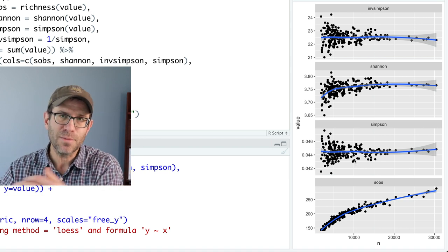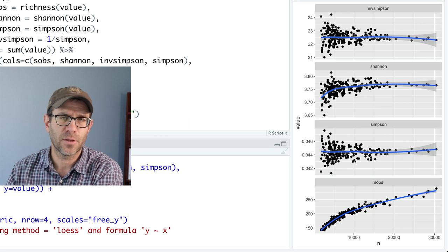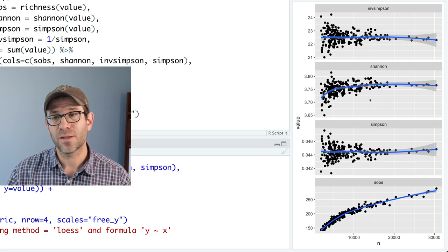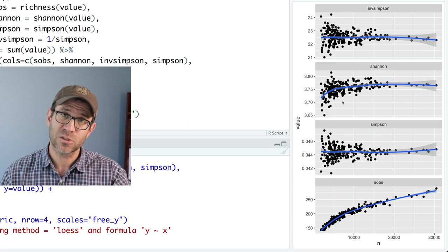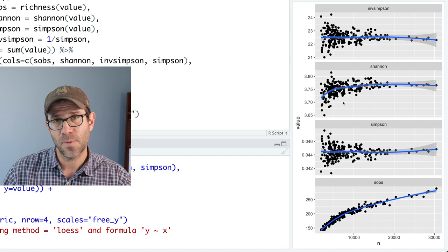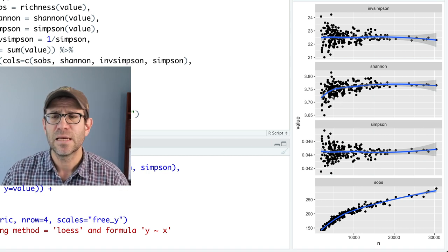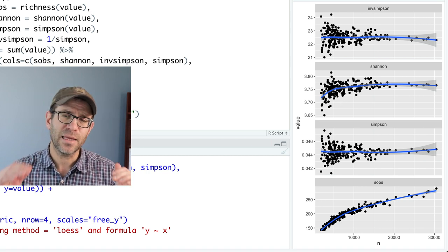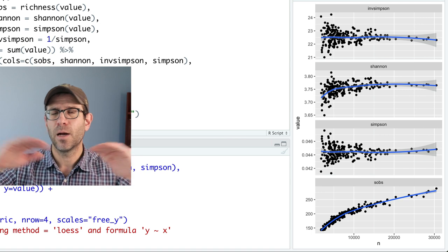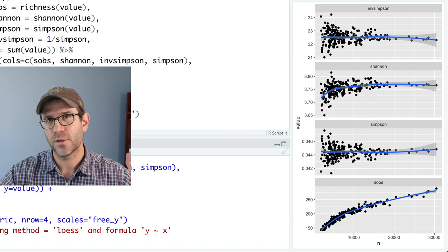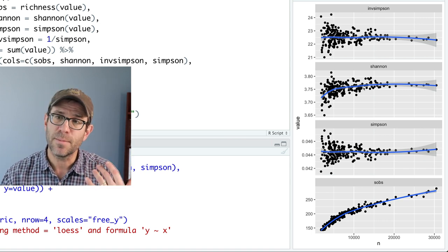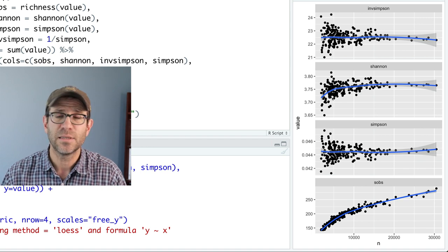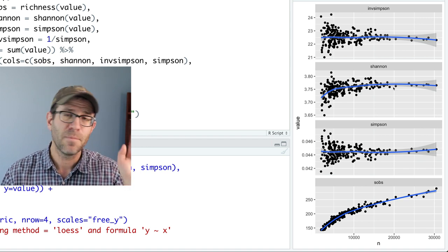And so as you sample more, you're really giving more definition to the rare members of the community. Something like Shannon, because instead of being squared, so relative abundance squared, it's the relative abundance times the log of the relative abundance. That gives a more balanced accounting of the different populations in the community. And so you see a bit more of a sampling effect on the calculation of Shannon.